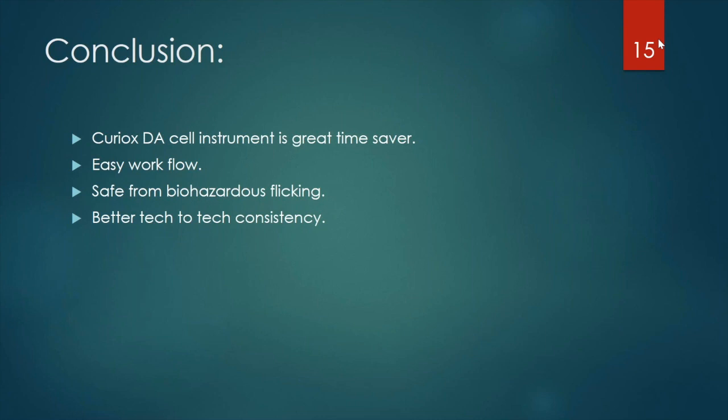That was not something I knew before, because I had done all this groundwork and I had presented it here. So I think this would save time for your optimization, but I don't think it should take much time, because at the end of the day, it is a washer. It is washing your cells and giving them back to you.